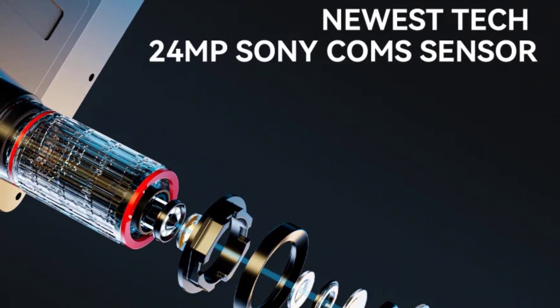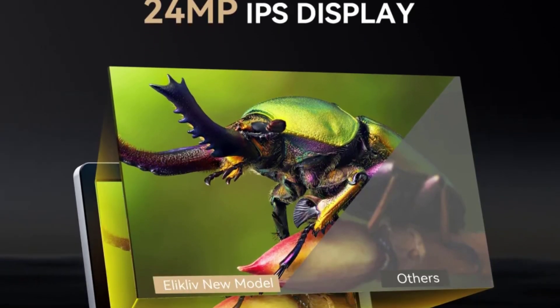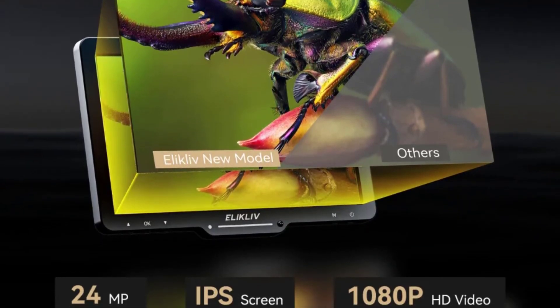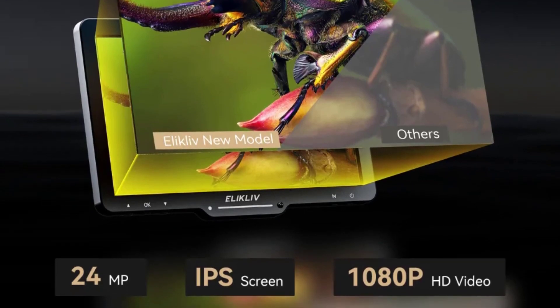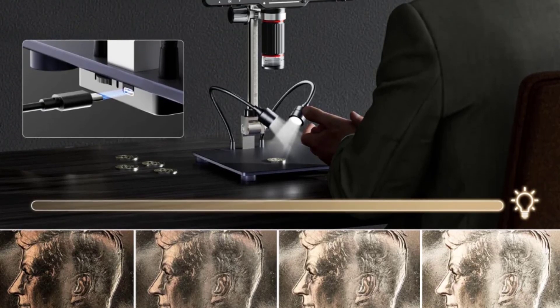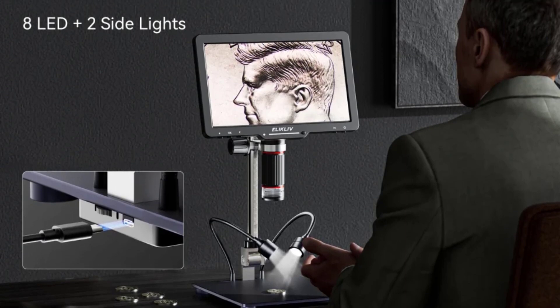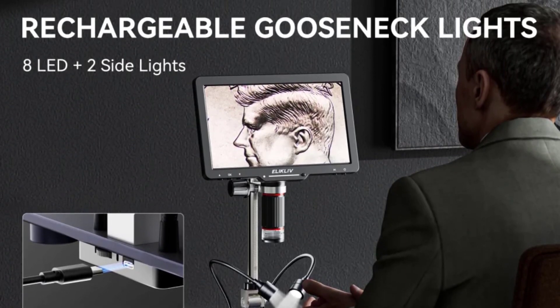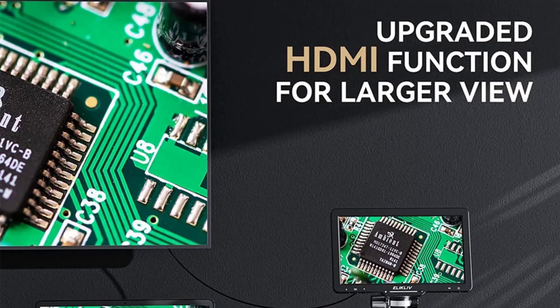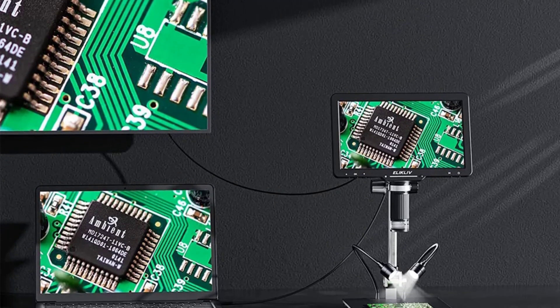The EDM-501 is loaded with features that make it stand out in the world of digital microscopes. The high-definition video microscope, coupled with the impressive magnification ratio ranging from 1500x to 3000x, delivers stunning clarity and detail. The LED light source ensures well-lit specimens, and the achromatic objective lens enhances color accuracy. One notable feature is the ability to take both photos and videos — this versatility is a game-changer, allowing users to capture and document their discoveries effortlessly. The EDM-501 truly empowers users to share their microscopic findings with the world.